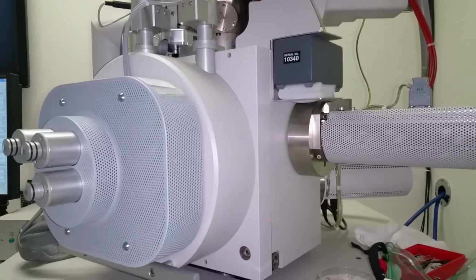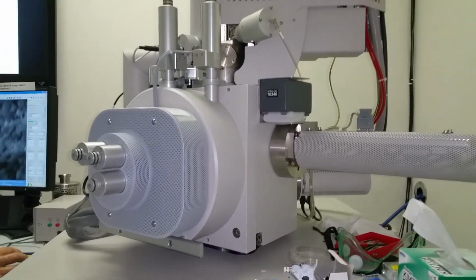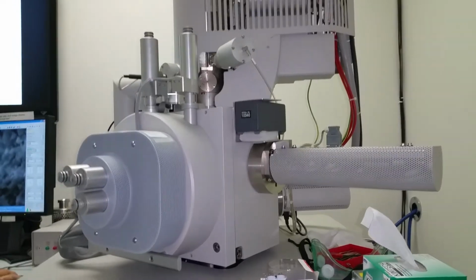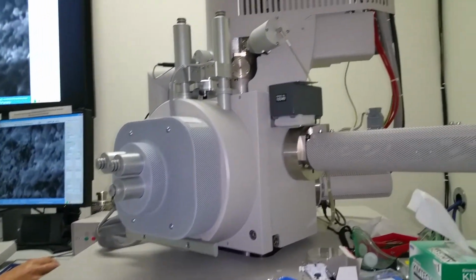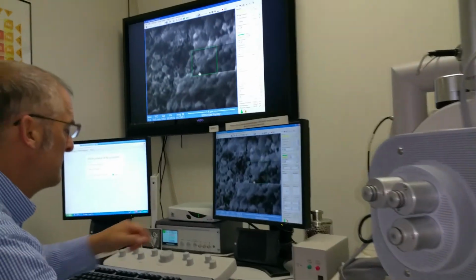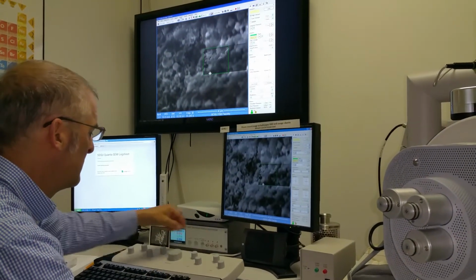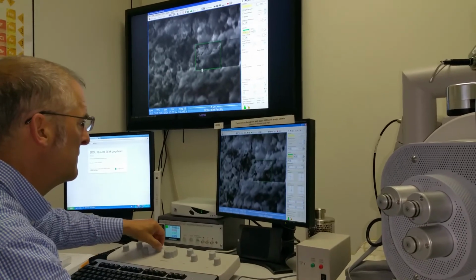Okay, today we are at San Diego State University, and we're in the electron microscope lab with the prestigious Dr. Steven Barlow. And he's going to explain to us a little bit about what this program is and a little bit about San Diego State University. So right now he's looking up some samples, and I believe he's looking at Drink Me microbially activated filtration sand.